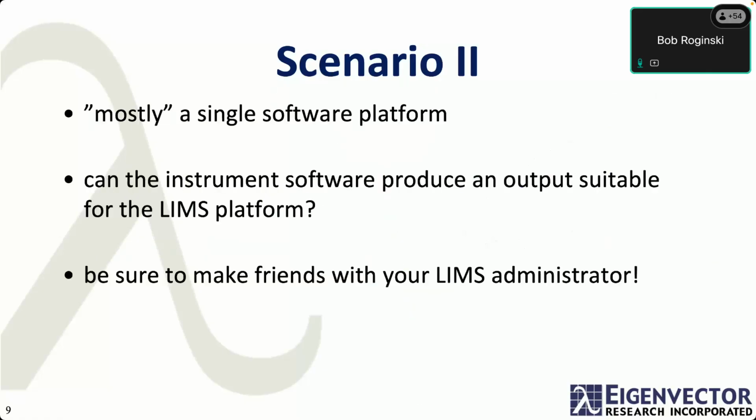I call this mostly a single software platform because you now have this secondary system, a LIMS system, that you want your results to ultimately reside in. And you need to figure out a way to get those results into that LIMS system. So the questions, second bullet point there: can the instrument software produce an output that's suitable for the LIMS system?